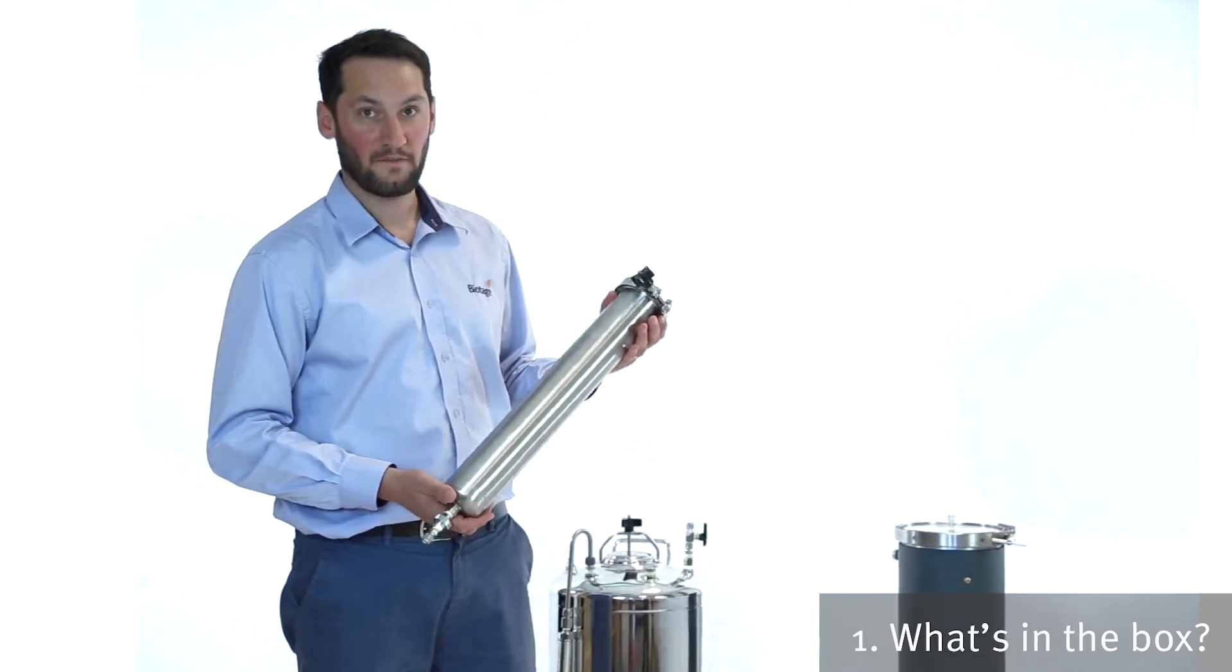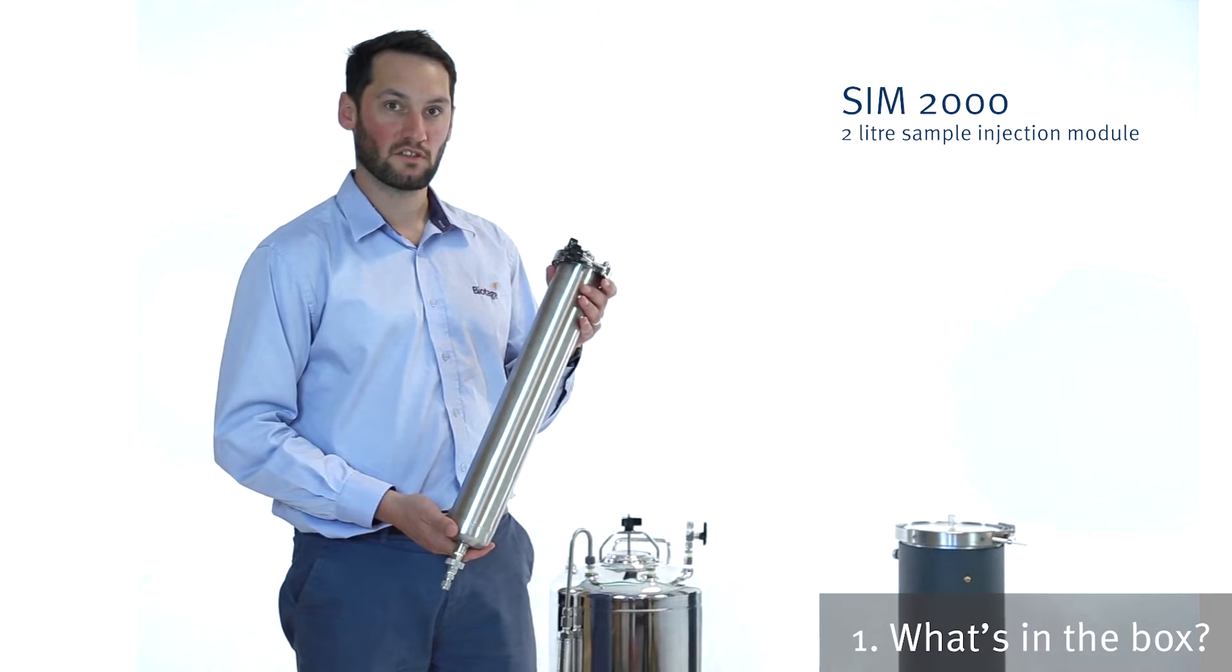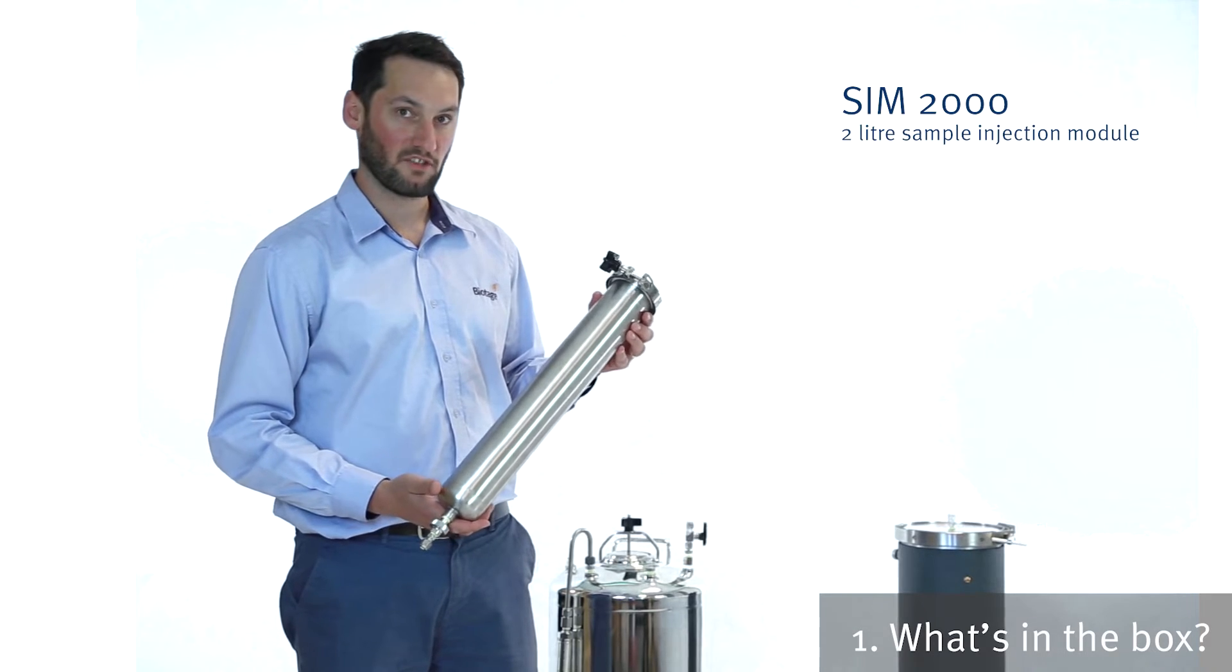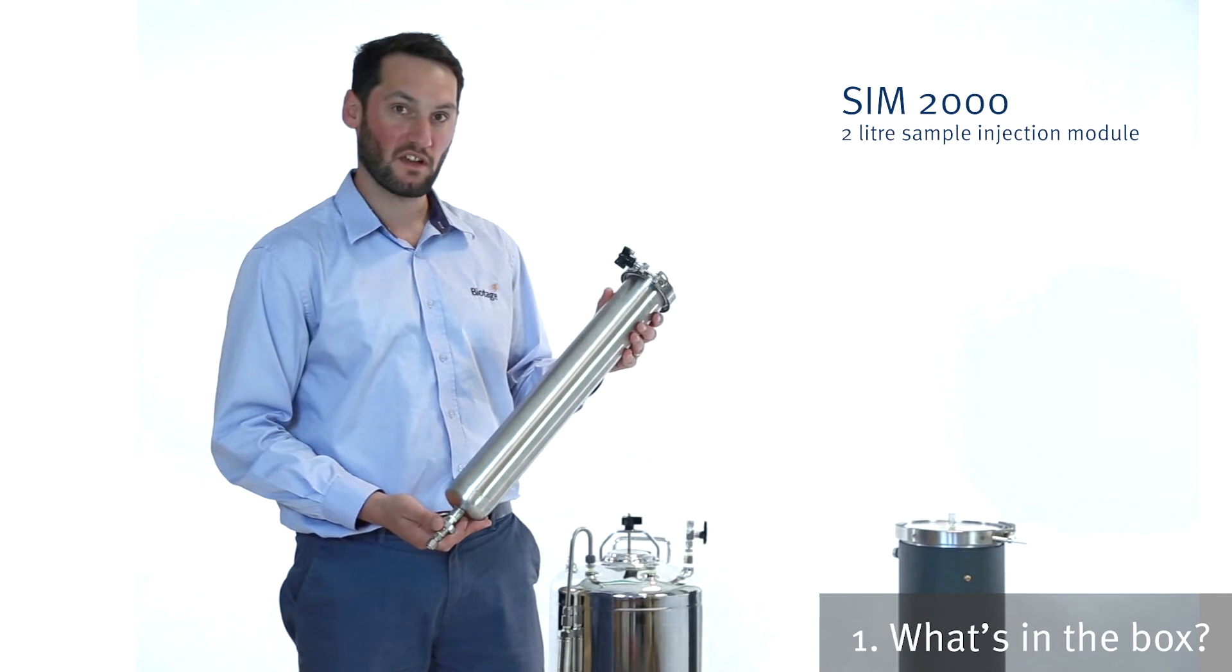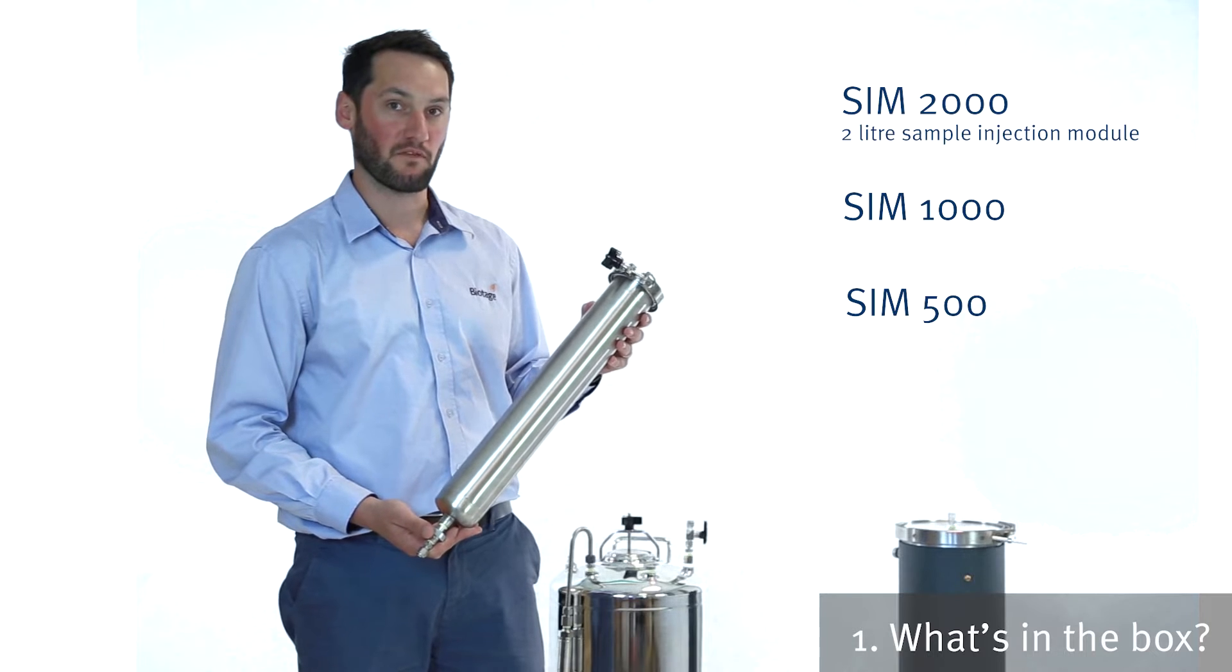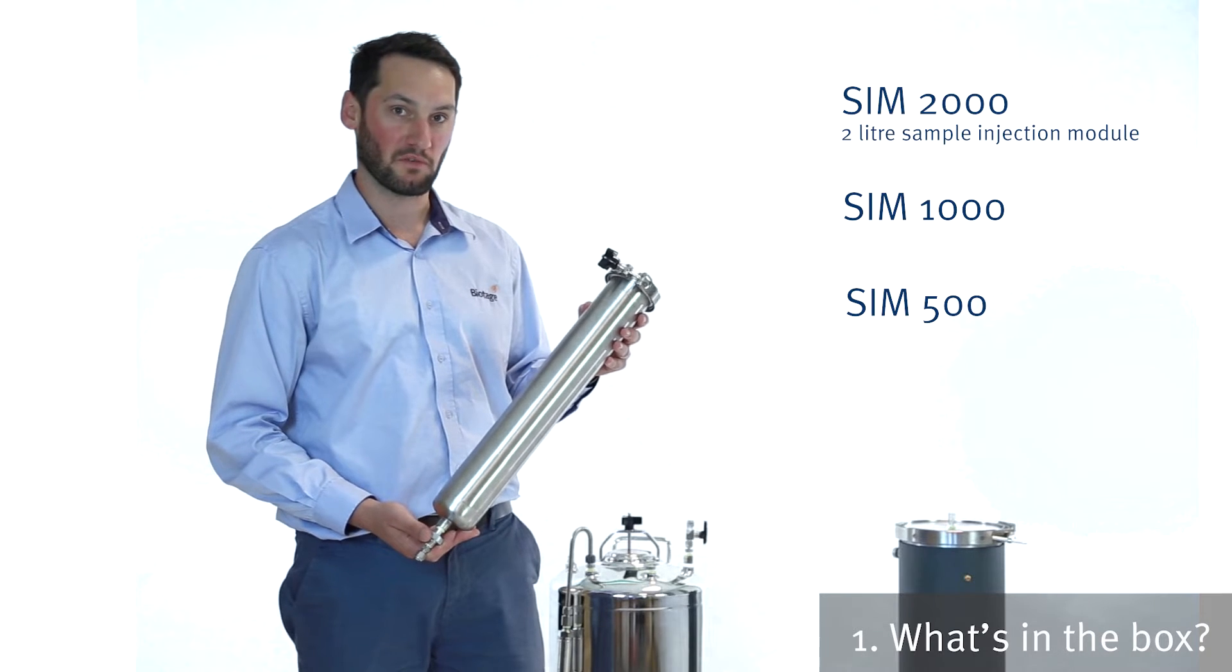So the Flash 150 comes with the SIM2000. That's a 2 liter sample injection module. You've got a smaller size, the 1000, and you've also got a 500. So that's a liter and 500 mils, two other sizes.